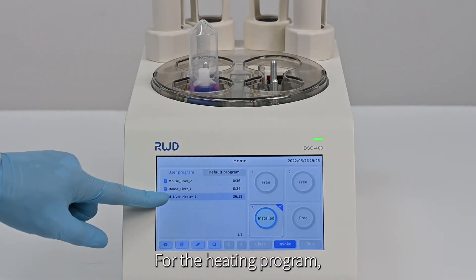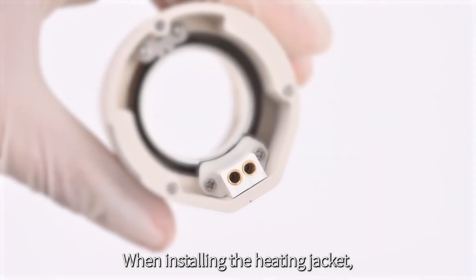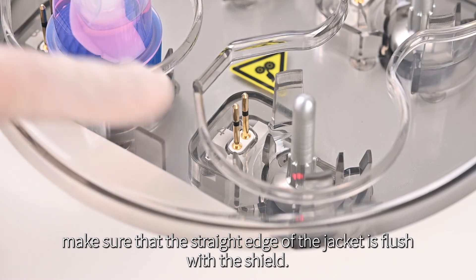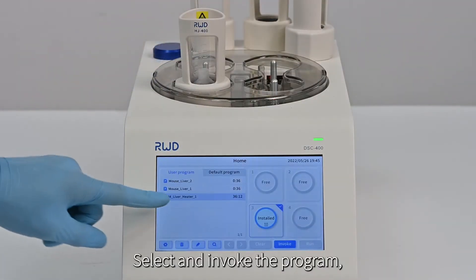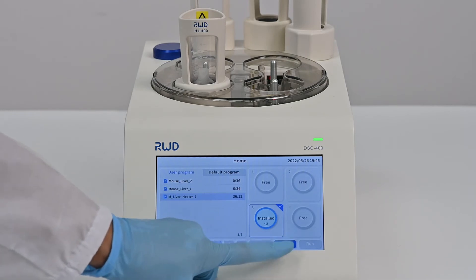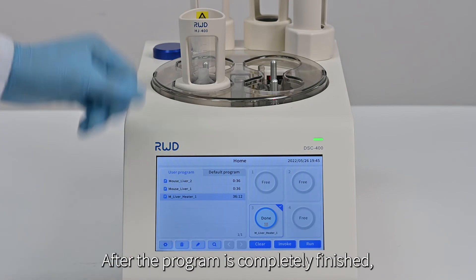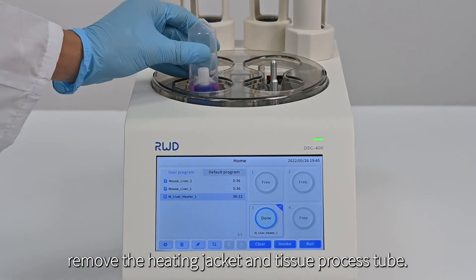For the heating program, the heating jacket is required. When installing the heating jacket, make sure the straight edge of the jacket is flush with the shield. Select and invoke the program, confirm, and start running. After the program is completely finished, remove the heating jacket and tissue process tube.